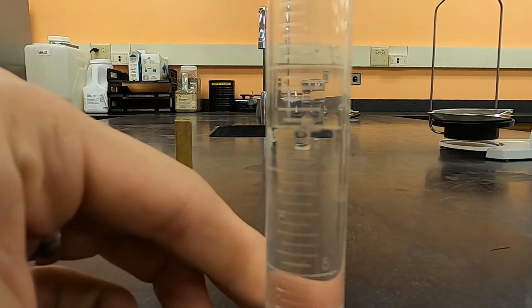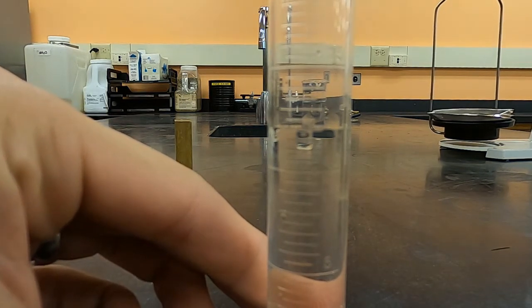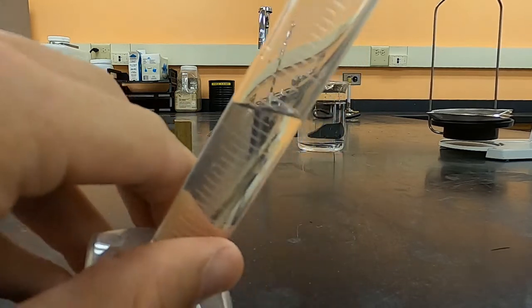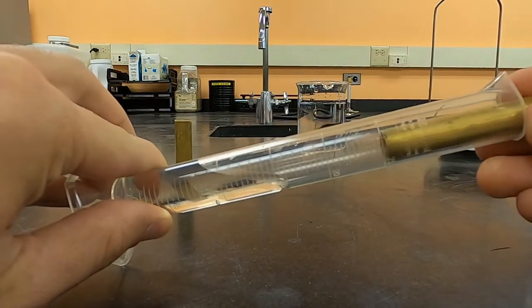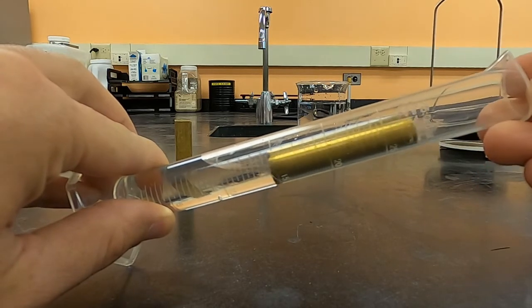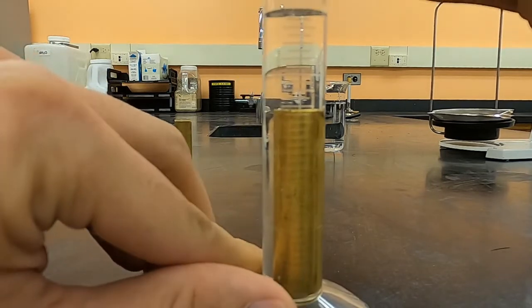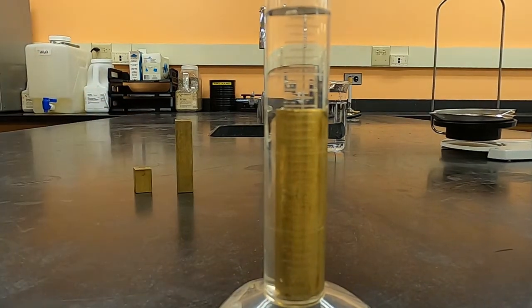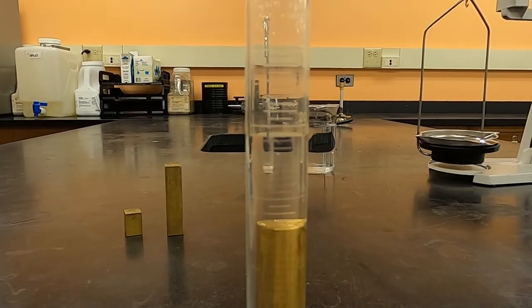When you slide your piece of metal in for this water displacement, it's important not to splash, so you're going to tilt the graduated cylinder as much as possible so that the metal slowly and gently slides in. You'll then again look at the water level at eye level.